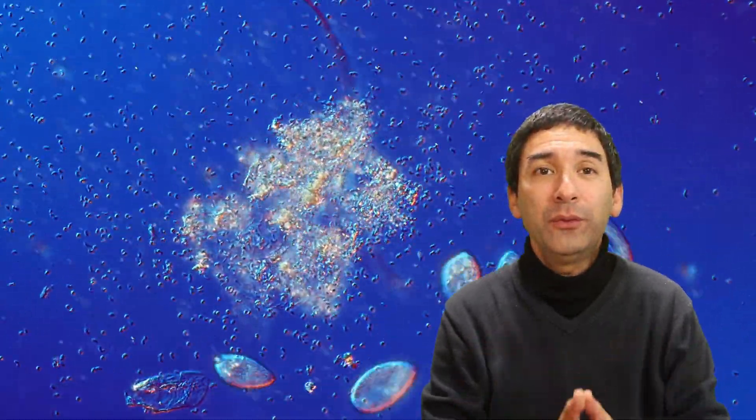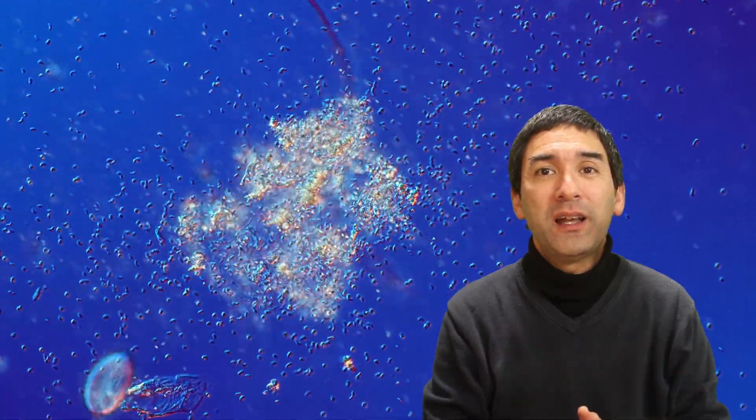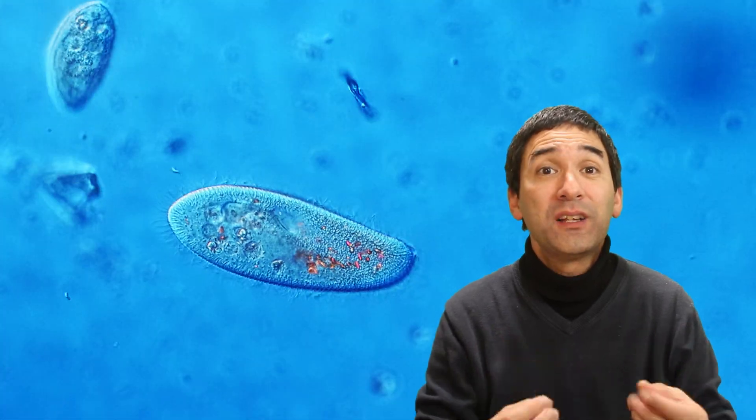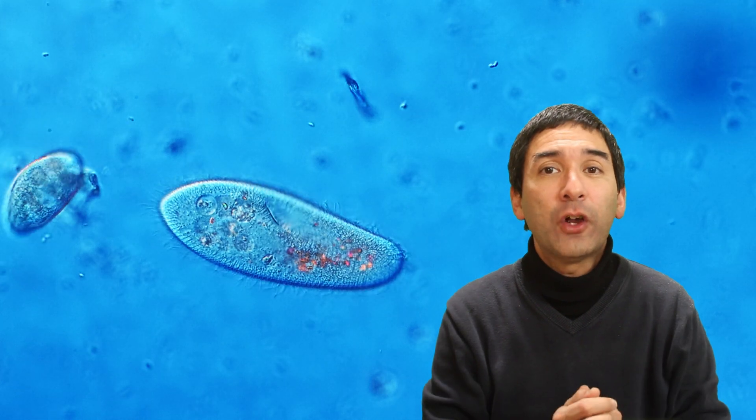Now, this here is a time-lapse video of some ciliates that are moving around on a microscope slide, and they're looking around for food, and those cells can be found in aquatic environments.